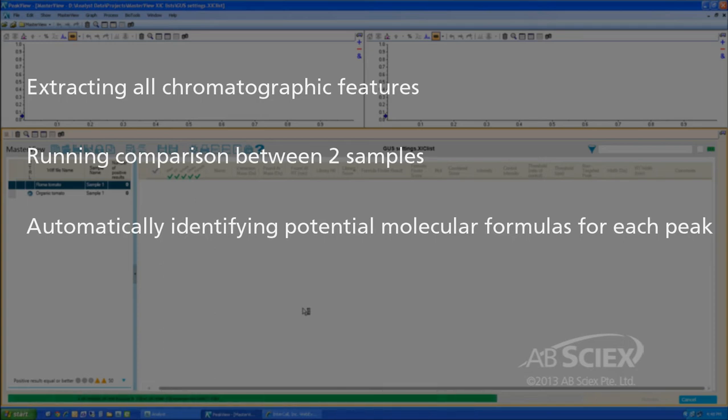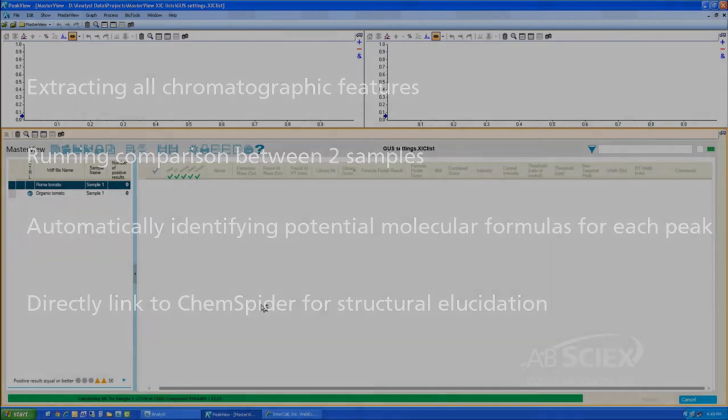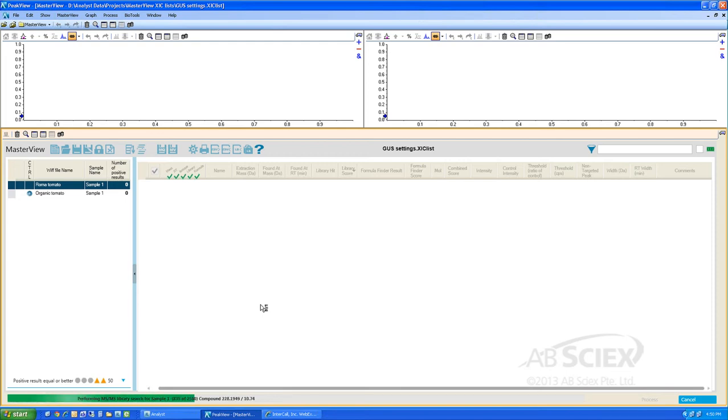Once the data processing is completed, we are able to investigate each suggested formula with a direct link into ChemSpider to investigate and assign an appropriate chemical structure to any unknown peaks that are detected. If we've selected MS-MS libraries to use for library searching comparison, the software will also compare the acquired MS-MS spectra for the unknown sample to all MS-MS library spectra.